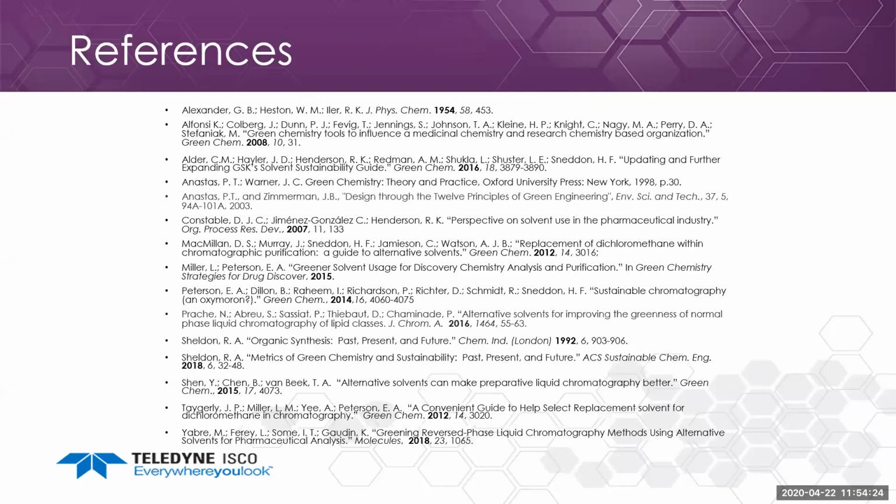So I'm not sure if one is better than another in this case. I do know that when I was purifying amines in graduate school, triethylamine was usually our go-to and seemed to have good success. You could use an amine TLC plate. We didn't show an example of that. We just used it in the column via the chromatogram.